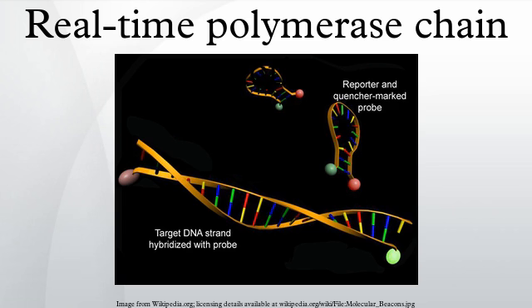Clinical quantification and genotyping. Viruses can be present in humans due to direct infection or co-infections. This makes diagnosis difficult using classical techniques and can result in an incorrect prognosis and treatment. The use of Qpcr allows both the quantification and genotyping of a virus such as the hepatitis B virus. The degree of infection, quantified as the copies of the viral genome per unit of the patient's tissue, is relevant in many cases.